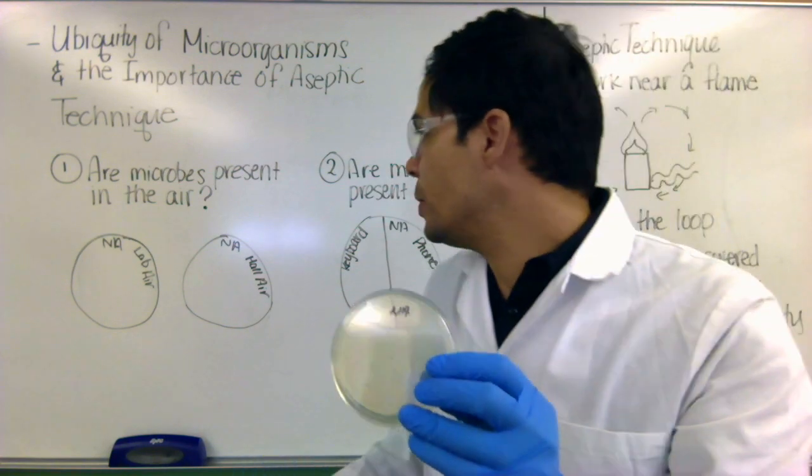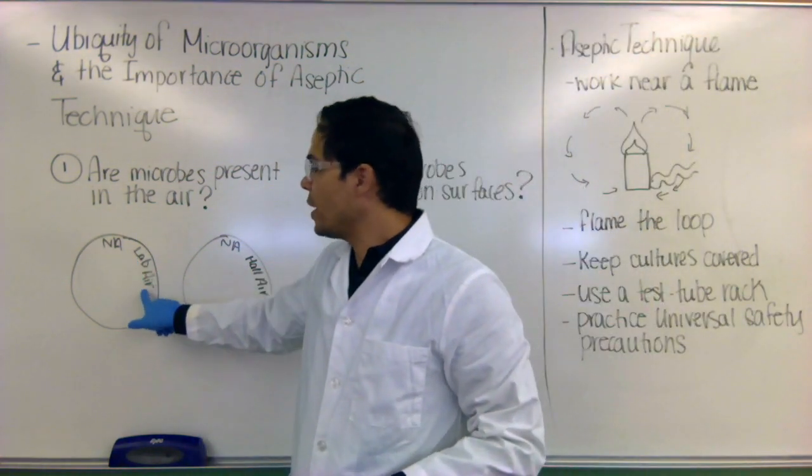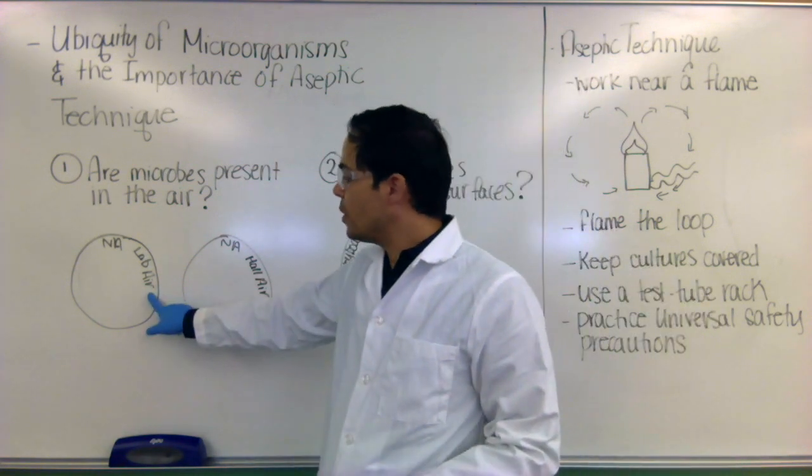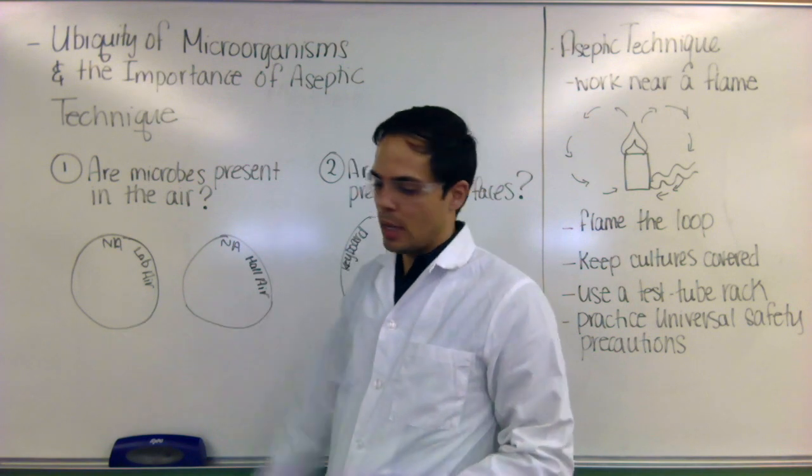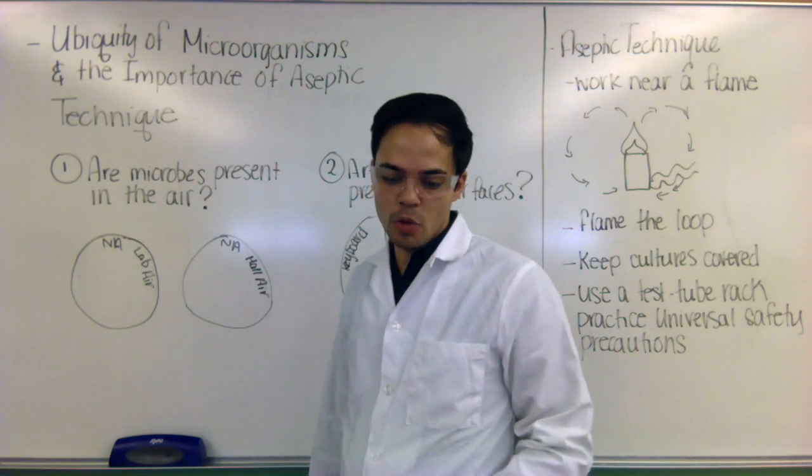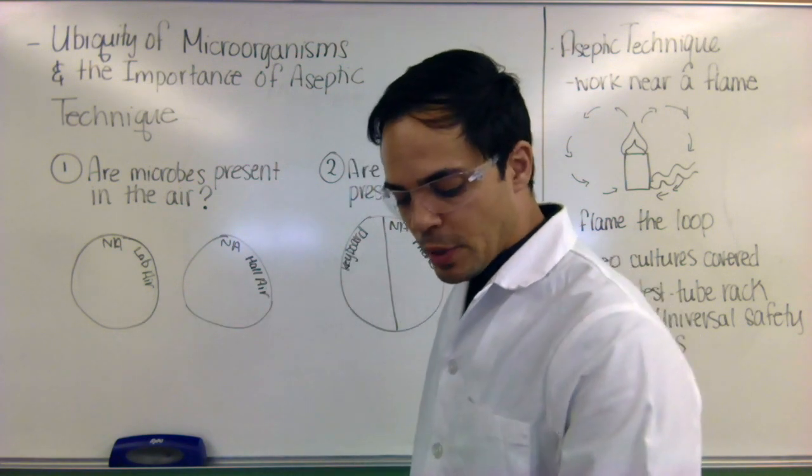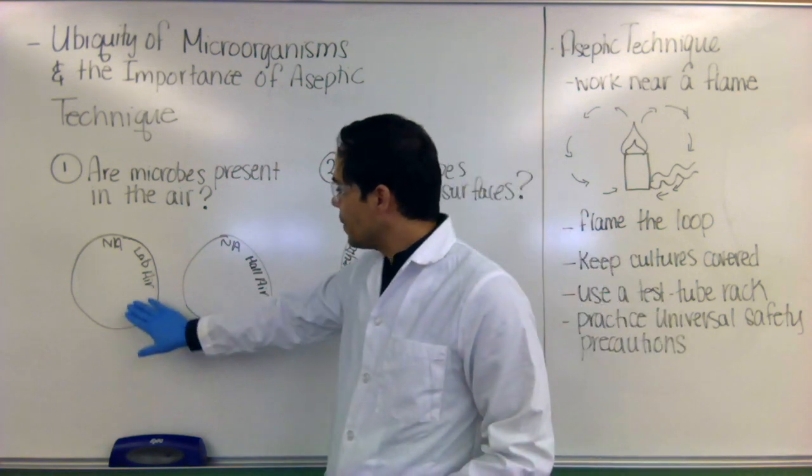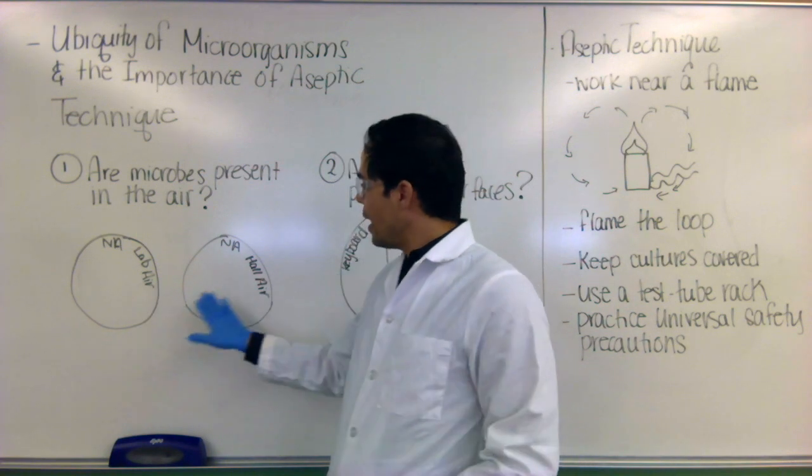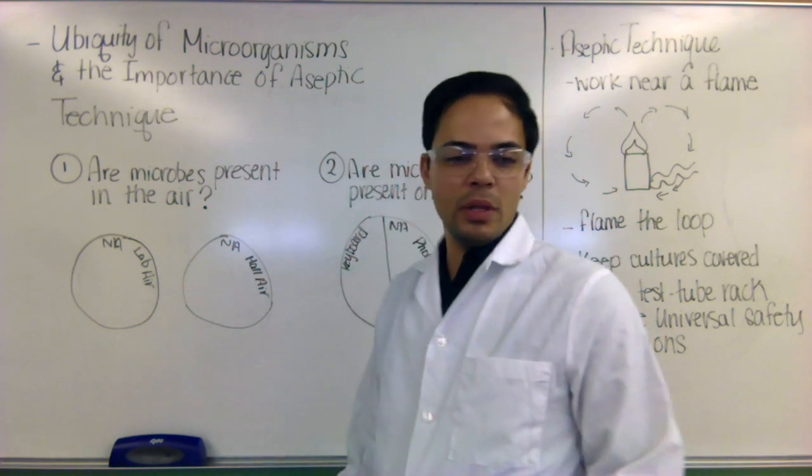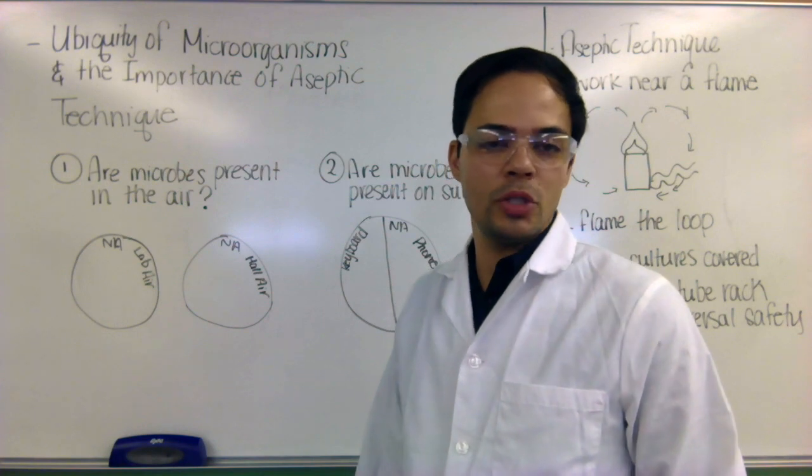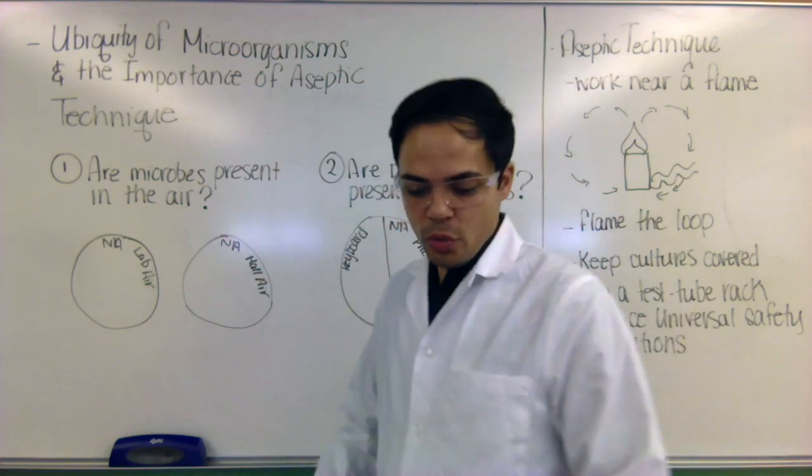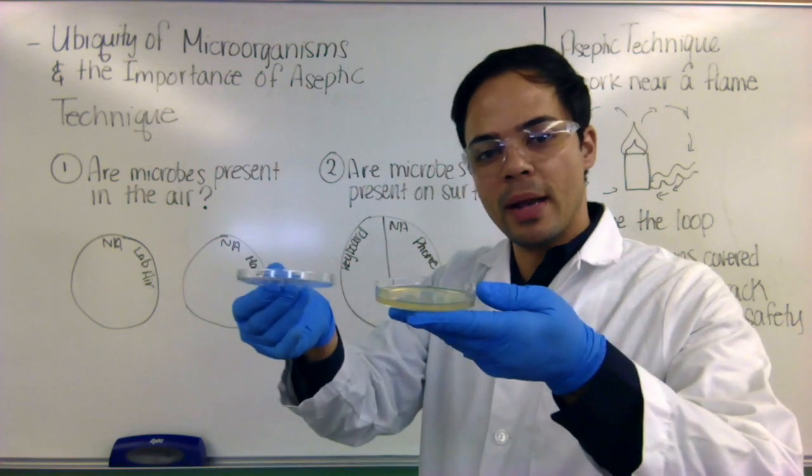So you label the side that actually has the medium in it, the base. So this is NA for nutrient agar, but you also want to write there where you're going to be exposing it to. And you probably want to write your initials and the date so that you know how long it's been incubating and that it belongs to you, especially in a laboratory where there may be lots of people working. So I'm going to take one of these, expose it to the air and one in the hallway. We'll leave it there for, you can leave it there anywhere from 20 minutes to an hour.